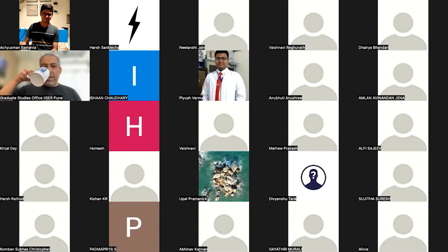Hello, sir. Yes. I had a doubt in confocal microscopy. In that, how can we see the interior of a cell? Right. So you're not actually seeing the interior of a cell, right? You're actually seeing a plane inside the cell. So if this is your entire cell, right?